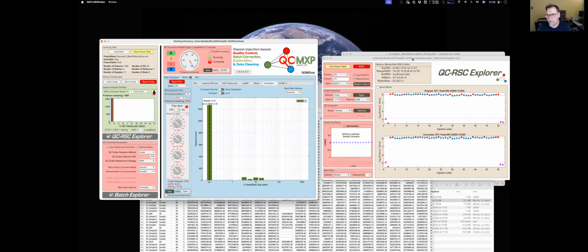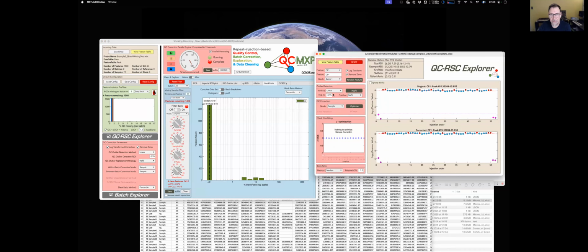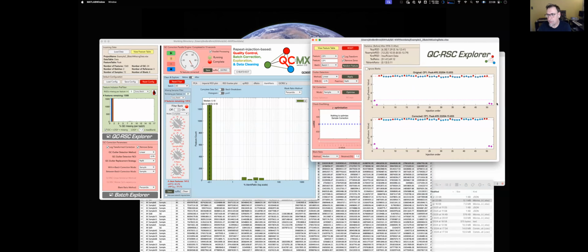Now, percentile, what it's calculating is the number of QCs that are below this line. So this line is 1.2 times the median of the maximum of the blank. The percentile blank ratio says what percentage of QCs are below that value. Because what I'm suggesting is that we actually don't mind things being close to the limit of detection, if you like, but as long as they're a majority above.